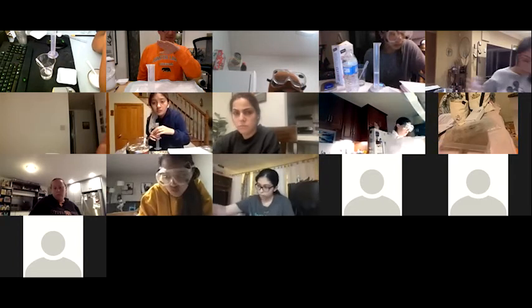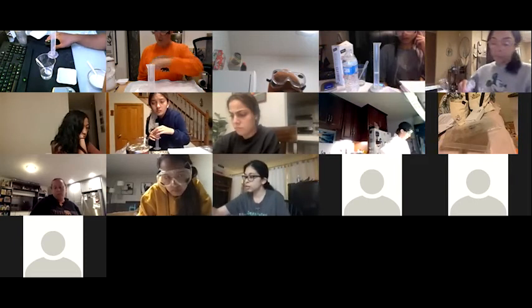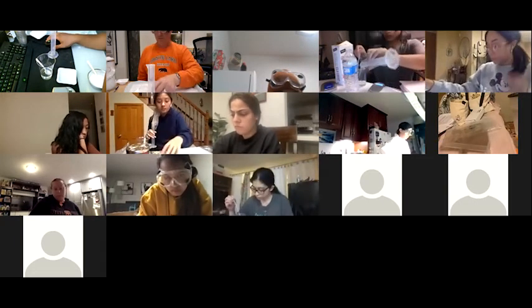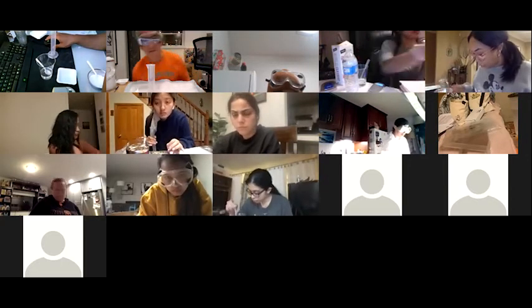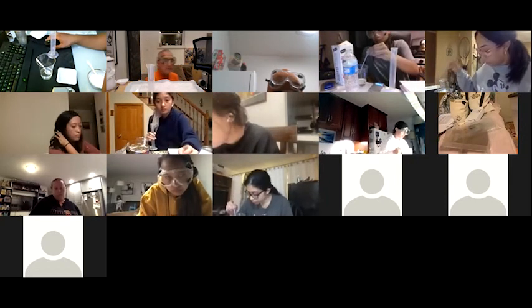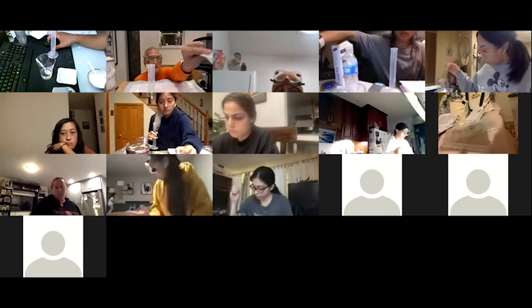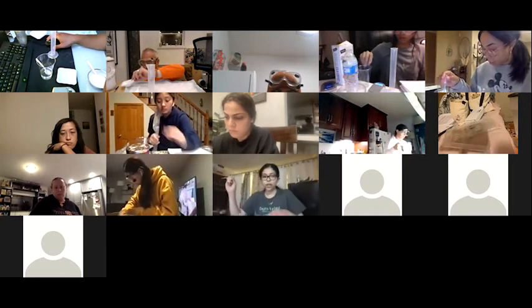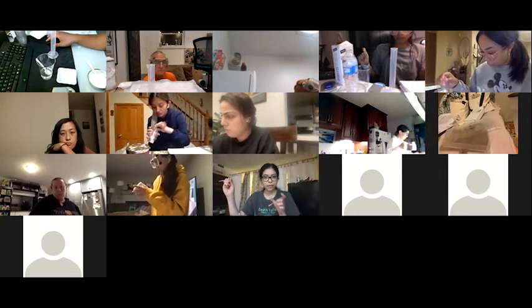And then you make it precisely 50 grams by either adding or taking away water with your trusty pipette here. So once you've got 50.0 grams, take the cup off and then use the weigh boat here to measure 5.5 grams of sucrose.